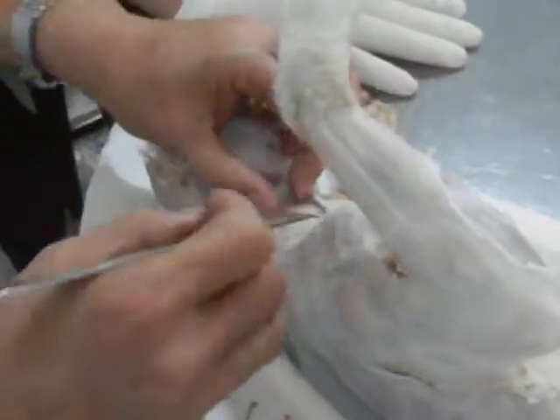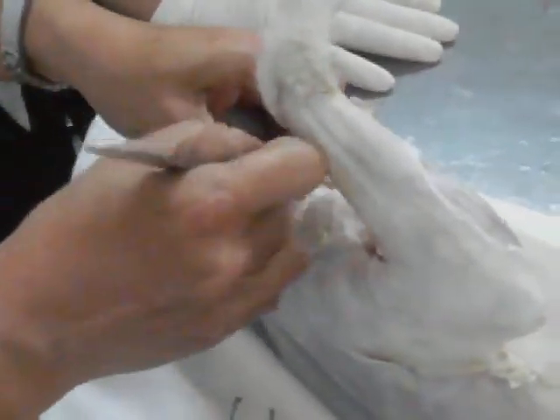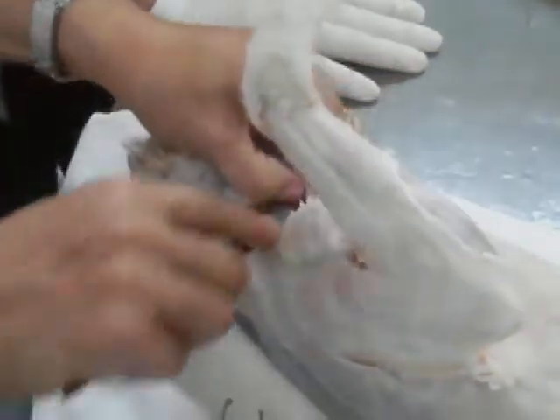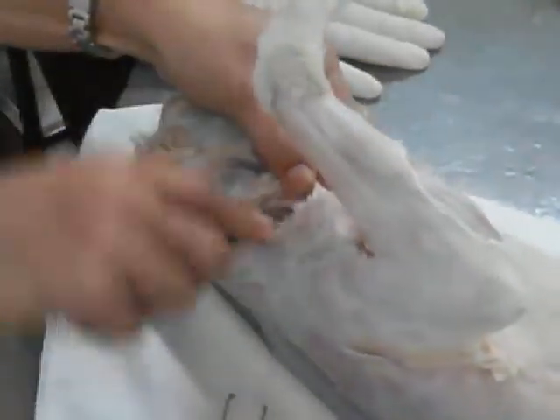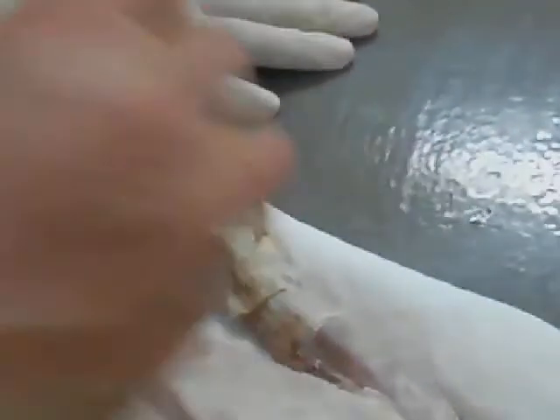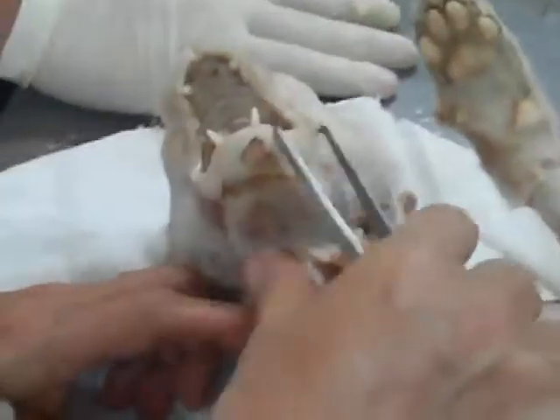You can now see this one. Cut this — you are now separating the sternomastoid from the clavotrapecius, and you are looking for a big muscle here. Pectoantibrochialis.